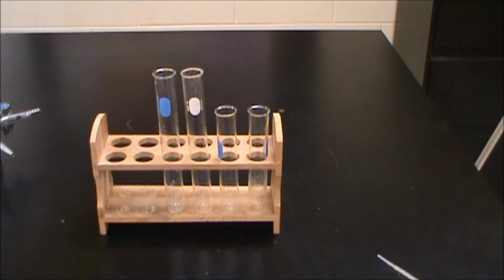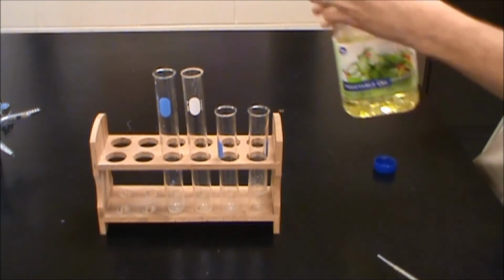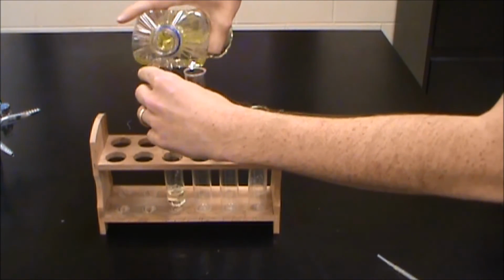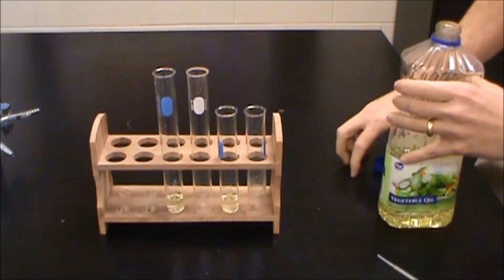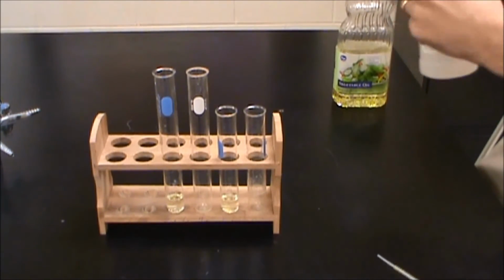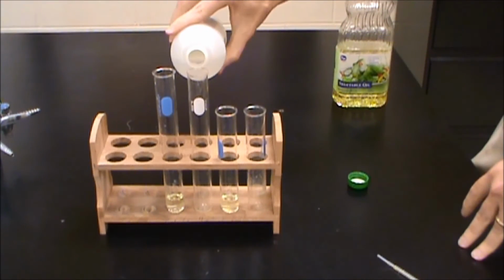So here I'm going to go ahead and show you the chemical reaction. So what I have is I have two different liquids here. The first one I'm going to pour into this test tube here. And this one. Okay. And then the second liquid I'm going to pour into the second and fourth ones. And one of these is going to have double bonds present, the other one's not.